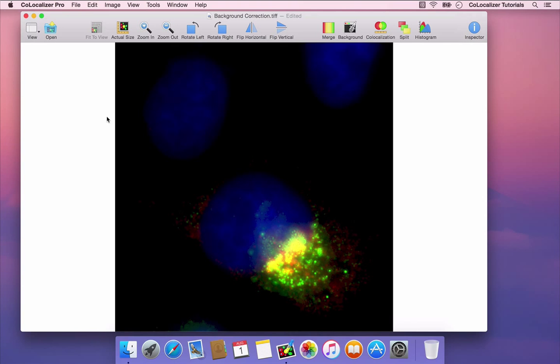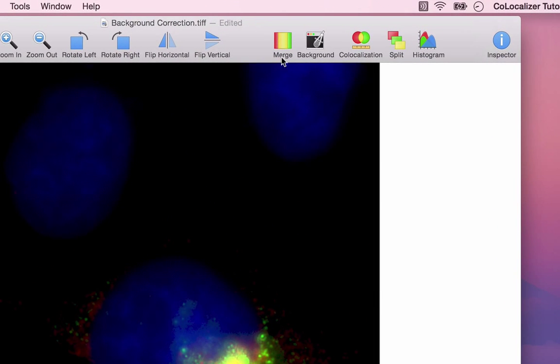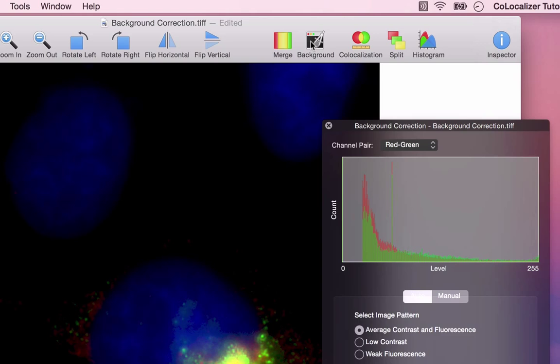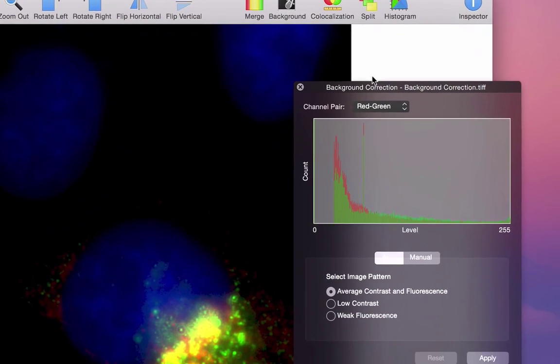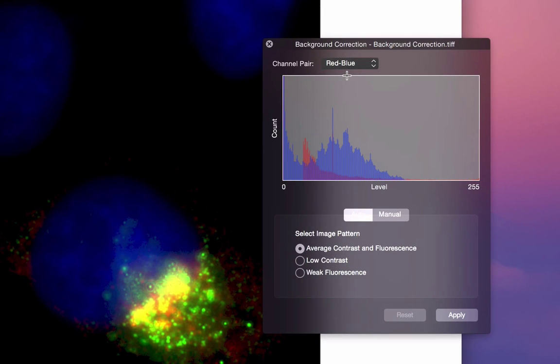To correct background, click the background icon and select a pair of channels. Choose the pattern of the image, for example Low Contrast, then click Apply.